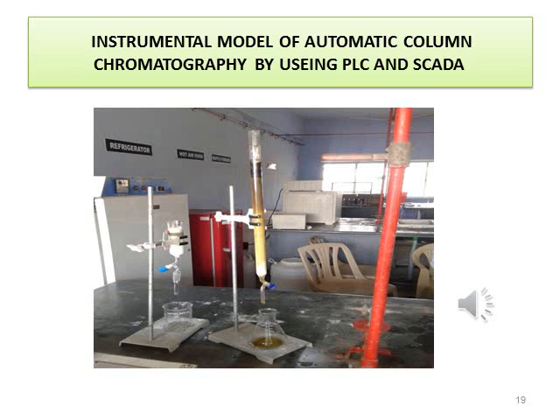Column chromatography is a major critical step in the extraction process because of the large amount of vapors coming out from the column.